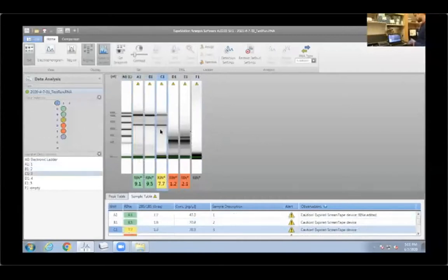Sample C has somewhat good RNA, not perfect like samples A and B. I would be confident in doing a poly A capture using this sample. I might expect some 3' end bias on my final reads, but we can still do poly A capture on these samples if we're only interested in messenger RNA. While for samples D1 and E1, you see from the RIN score that the quality is really, really bad. So we are going to take a different look at these samples.